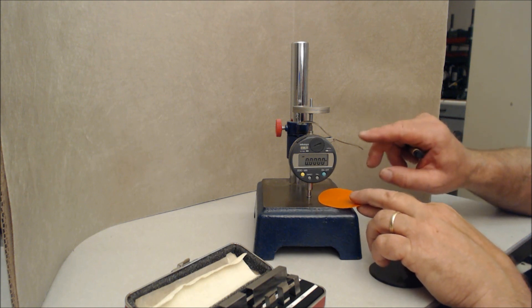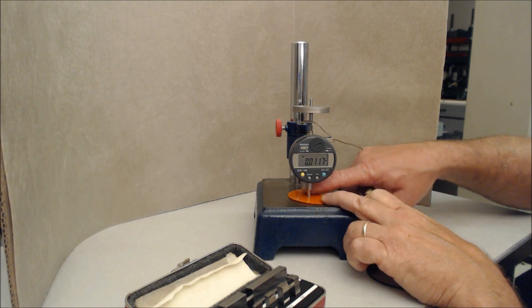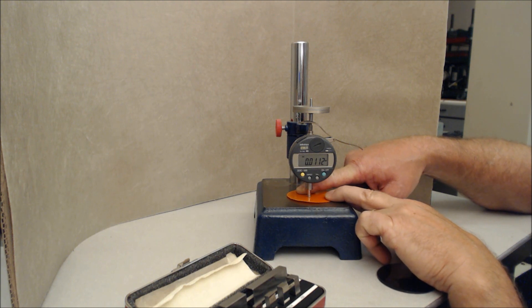The next is a film, and this film is much thinner than the geomembrane. Here you see it, again using fingers to push down any curl in the material. This is giving 11.2 mils, or 0.0112 inches in thickness.